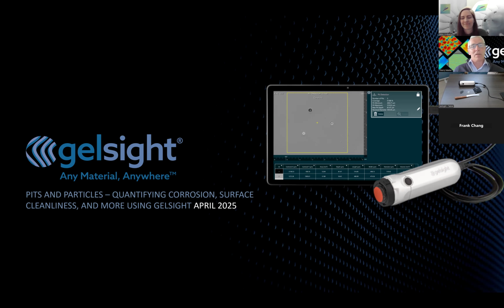I will not enter into too many details. Corrosion is a complex phenomenon which presents different typology. It's very important to know that during this webinar, we will essentially focus on the early stages of corrosion, which are under the form of pits or buildup. We will not be able, with the limitation of the GelSight technology, to identify corrosion creating galleries under the surface. These will not be addressed by GelSight.